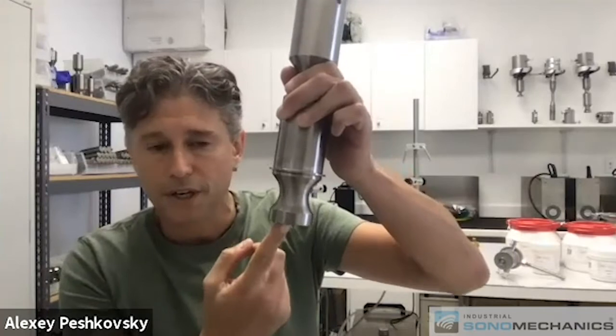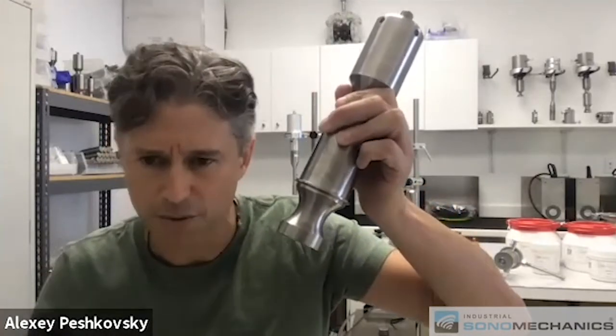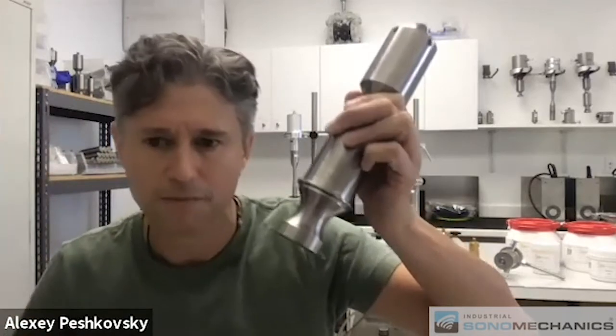The amplitude on this large horn is extremely high — something like 115 microns, which is overkill for most processes. So the summary is: we can scale up any process that works on the lab scale to any scale that you want without losing the quality of the results.